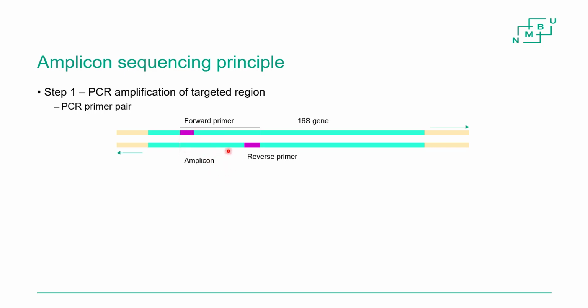So we only see, or we actually copy, this piece of the genome. The rest is lost now, right? So we are left with only this piece of the genome.